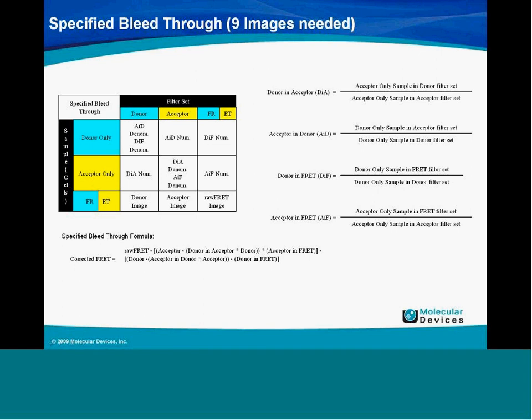The purpose of this webinar is to look at the tools that are available within MetaMorph to do the analysis. I'm not really going to go into much more detail than what I have as far as the overall experimental setup. These are things that you'll have to work through based on the literature that you're looking at.